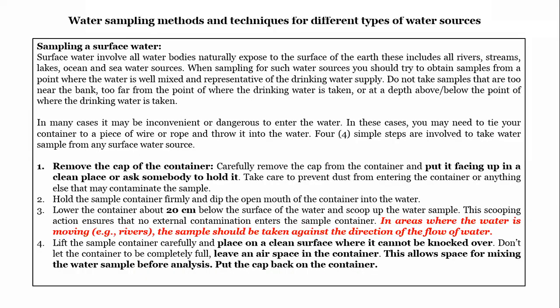Okay, so this is the first process here. We have sampling a surface water. Good. So I'm going to rush on it now. There are some parts which I'm not going to talk much about. So the first step, you're going to read the other part of it.